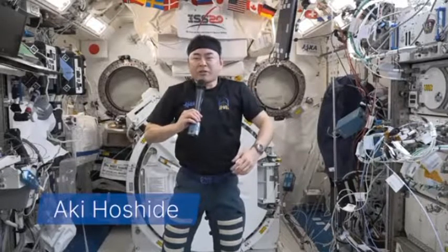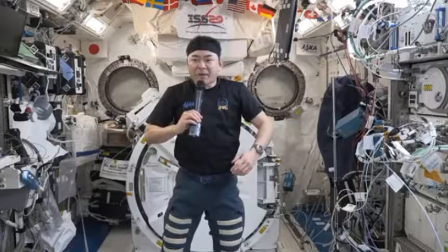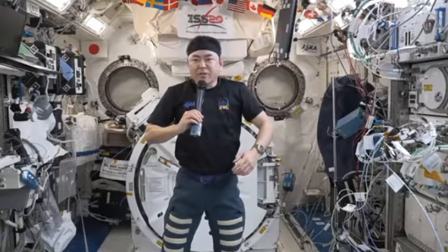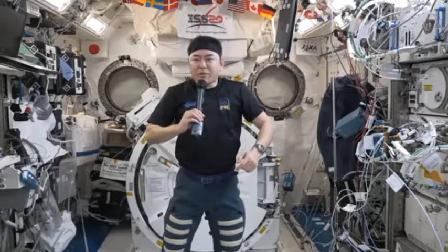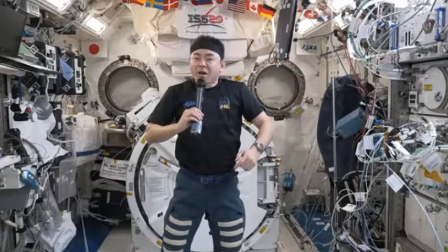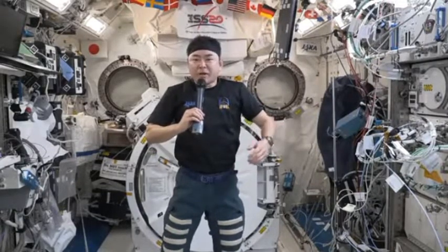Today, we are going to discuss the importance of having safety equipment and personal protective equipment, or PPE, in any lab setting. Safety is a necessity to conduct any scientific investigations, even up here in space. Do you think we should use the same safety equipment you have back on Earth? Come check out how we stay safe in our orbiting lab 250 miles above the Earth.